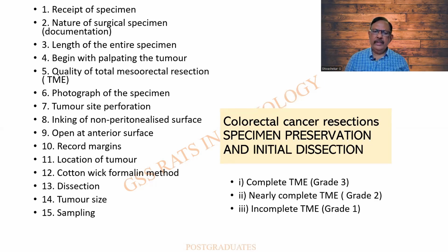And from where I had given the bits. So these are the various types by which we will be able to give a grading. When it is going to be confined to the mucosa, and when it is completely involved, and then it is traversing even further, this grading can be of use.